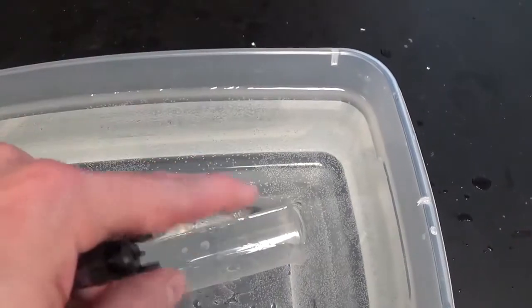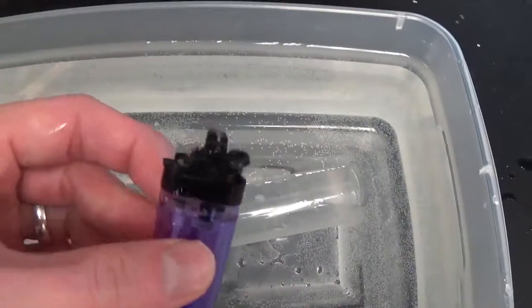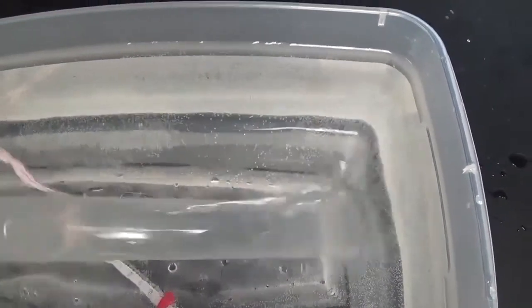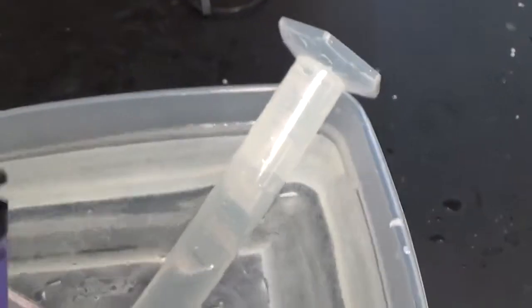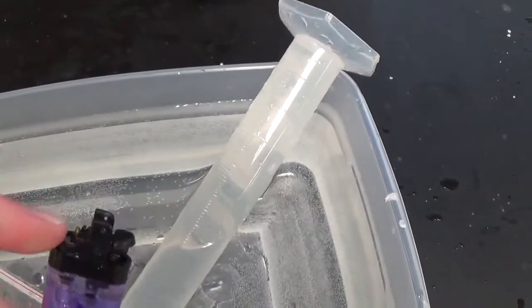Remember the butane is bubbled through water. And when it bubbles through water into the graduated cylinder, the gas that we collect is not just butane. It's also water vapor. So we need to subtract the pressure of the water vapor, which we can look up in a table since we know the temperature.